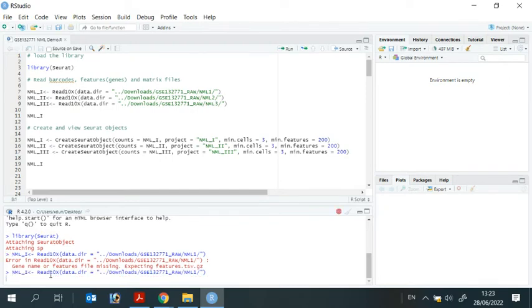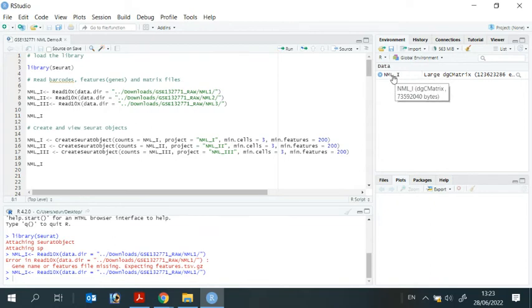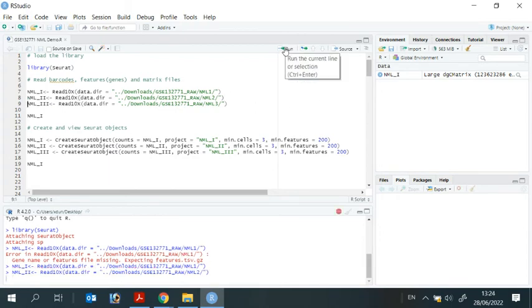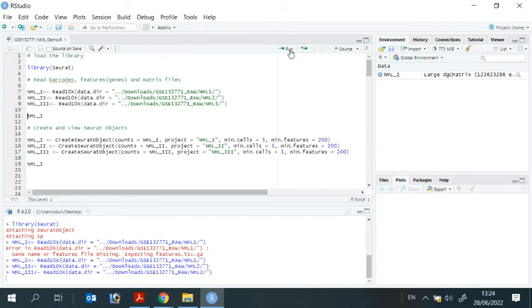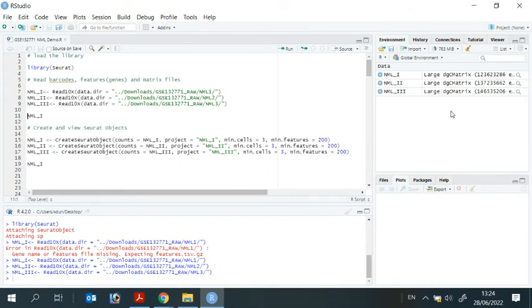Now we can go back, press run and read the nml1 data again. We just press run. You can see now it is running. Yeah, you can see R read the nml1 data into here. We can continue to read nml2 and then read nml3. So we have all three repeats.